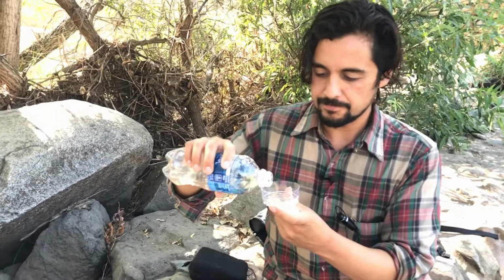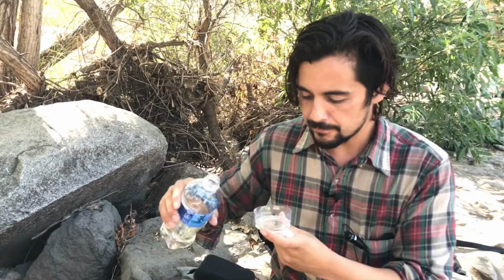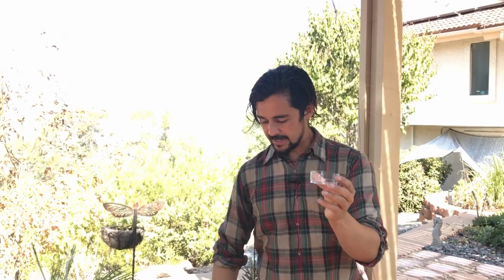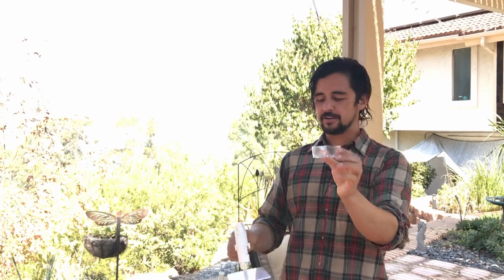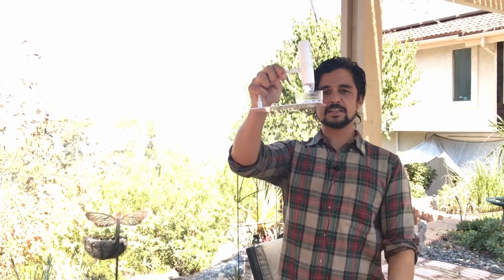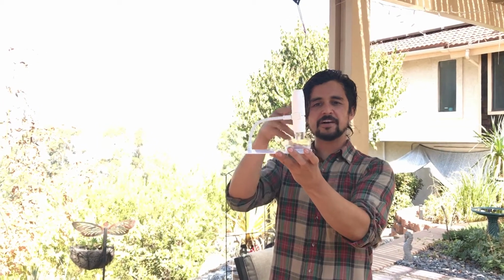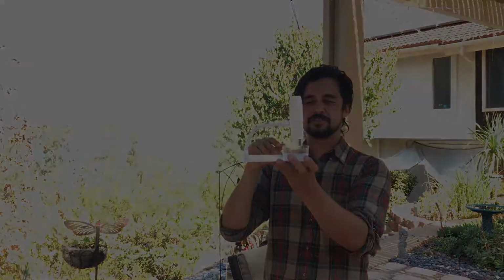You might want to make an observation dish, somewhere where you can pour your sample in and then make observations from this dish. This dish was made from an old plastic cup. I just cut the top off, and now I have a way to kind of hold those organisms temporarily. And I'll place that underneath this digital microscope platform, and that'll be kind of the area that I'm making my observations from.